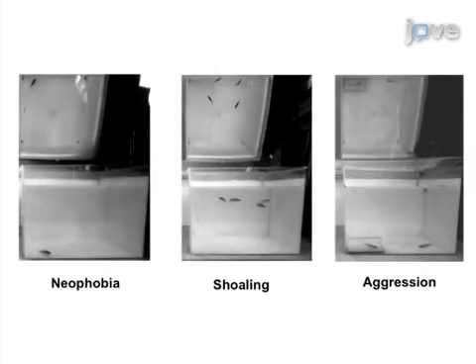Ultimately, the high-speed calibrated 3D tracking is useful to study the behavioral deficits in mutant zebrafish and the effects of drugs on a variety of behavioral systems for the purpose of drug discovery.